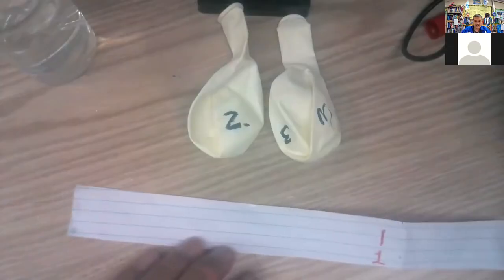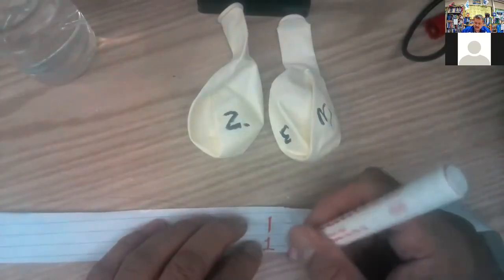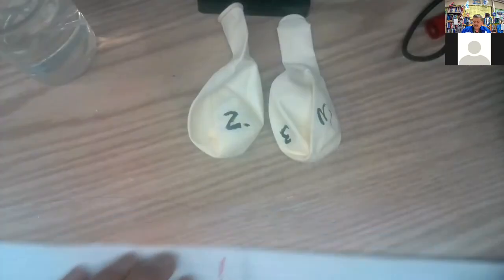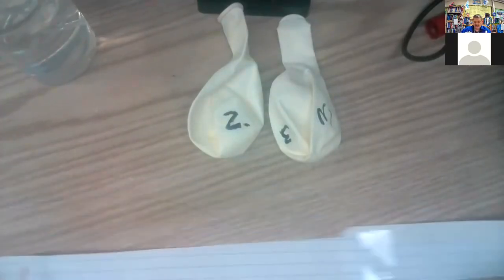I just marked a piece of paper with number 1 and 0 minutes. All right. All the measurements will be from this end.